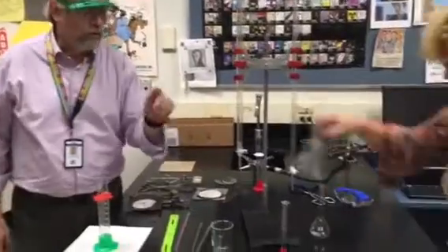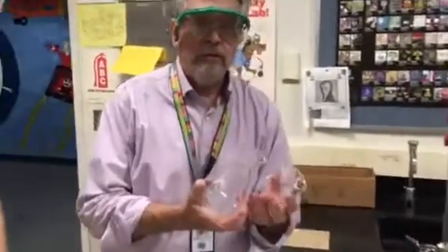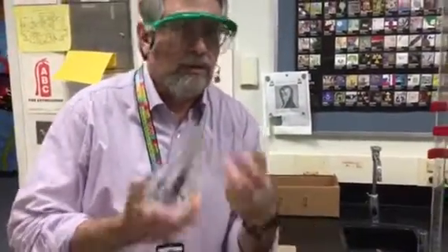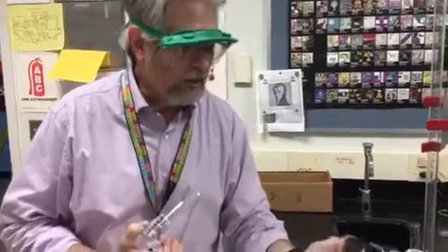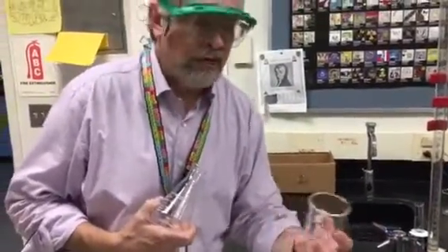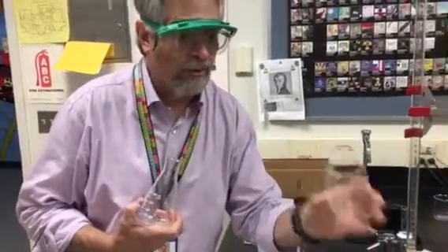No? Oh, no. Should we do the Erlenmeyer? Yes, Erlenmeyer, last one. Okay, this is the last one. These two are the least expensive pieces of glassware that we purchase in chemistry because they're not very precise. So Ms. Rinaldi might say, or Mr. Sobleski, do you have about 100 milliliters of acid? I go, yeah, I have about 100 milliliters of acid. I don't know how much I have. I would never say 100.00 with this.